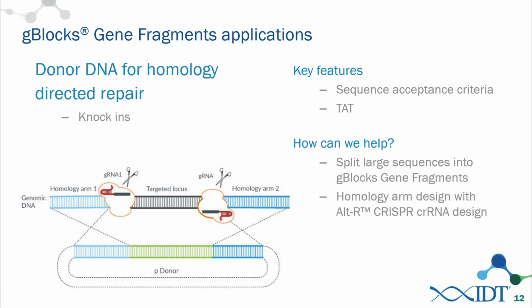I would assume that you would recommend that they contact you with the specifics of what they want to do, the genes at IDT DNA. Yep, absolutely. And we've worked with a few customers in the past, and we've been able to come up with some fixes for things, but it's pretty limited. Yeah, there's not a great solution, particularly if you want things in the middle of the sequence.